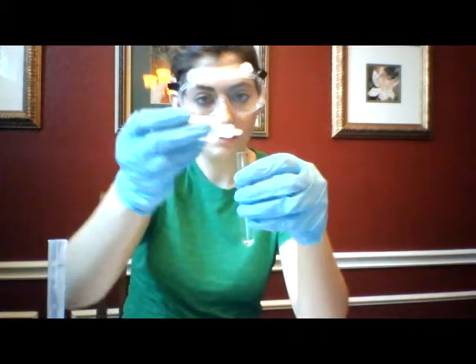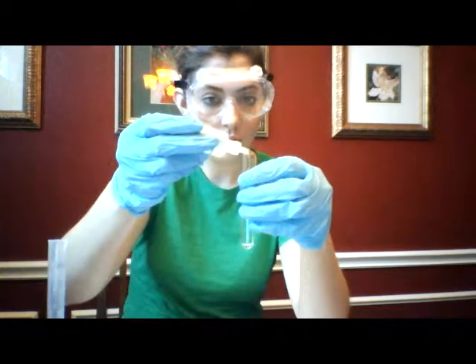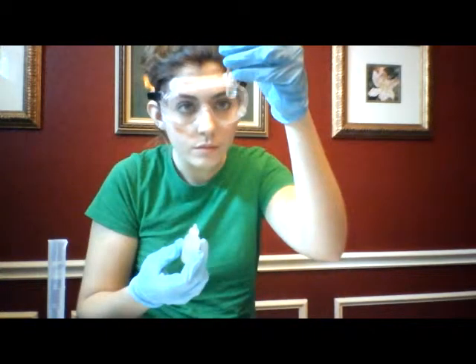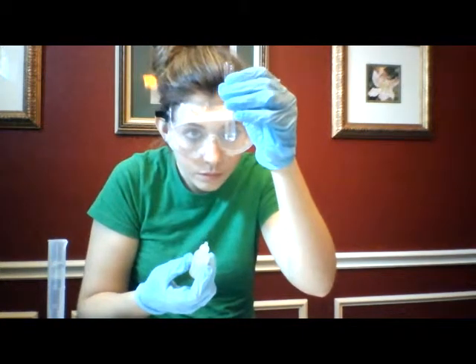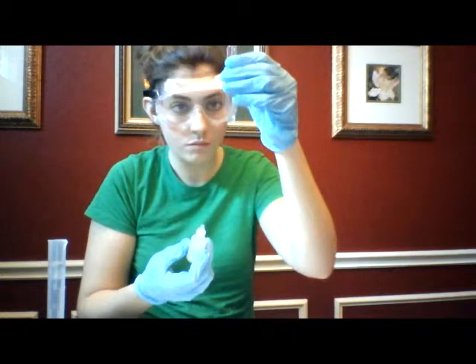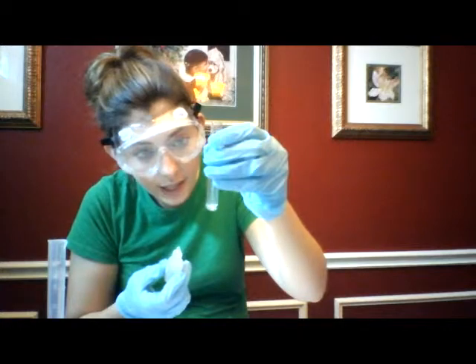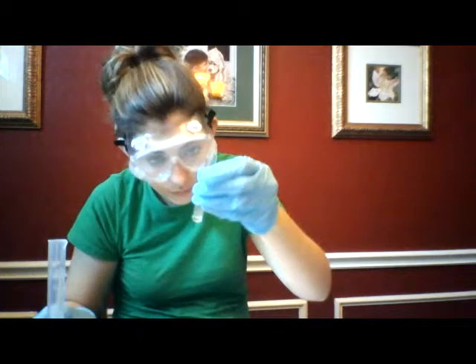One, 2, 3, 4, 5, 6. Not really action there. Seems to have stayed clear. I'll let that sit for a little bit.